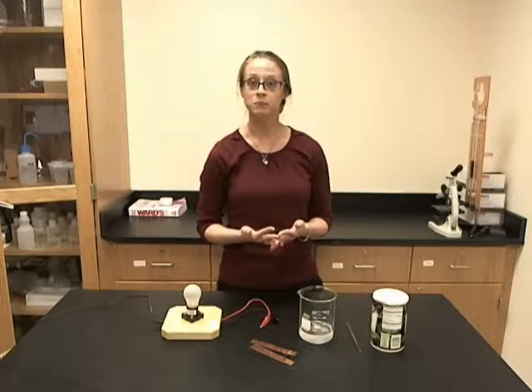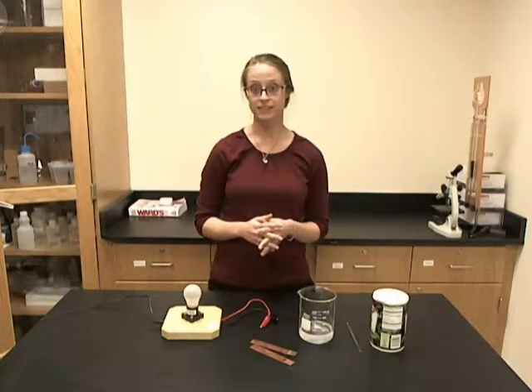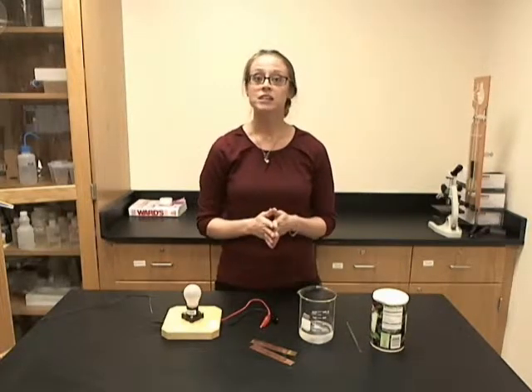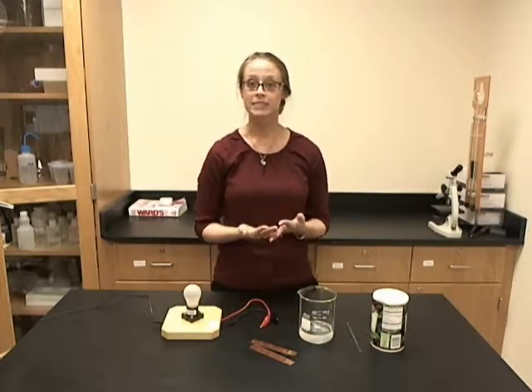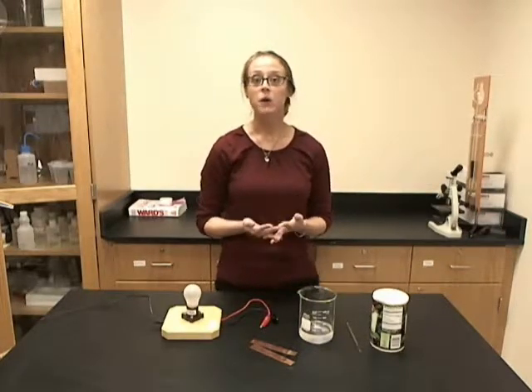All that you will need to provide are a universal adapter and the liquids for testing. Now you can test a variety of liquids with this, such as tap water, distilled water, salt water, hydrochloric acid, or alcohol.